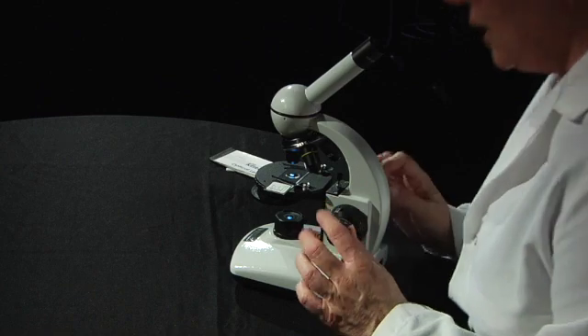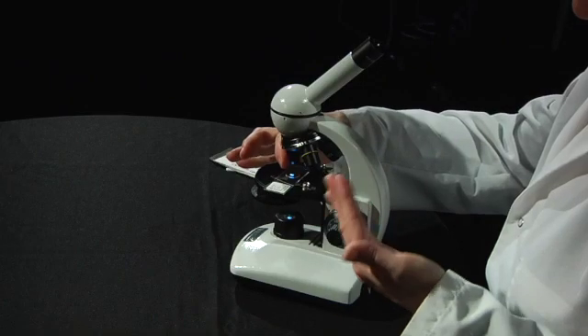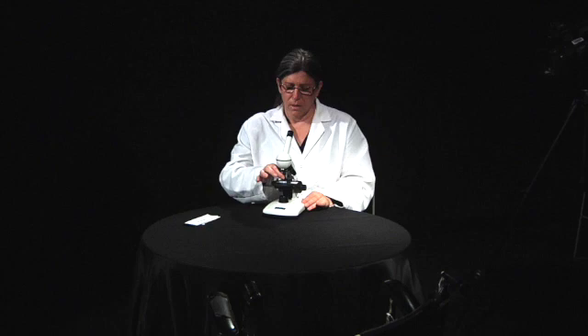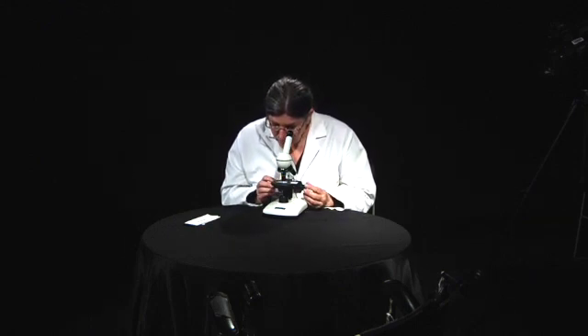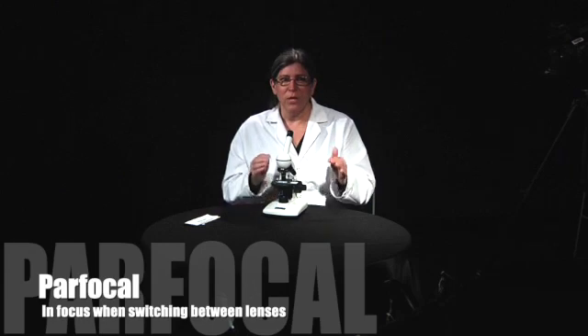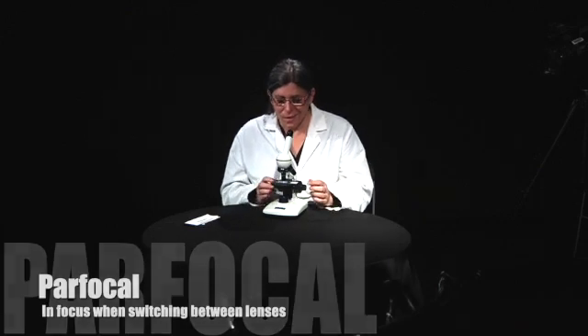Once you get it mostly in focus you can use the fine focus to get it really crisp — the fine focus is a little bit better at getting it to the final crisp stage compared to the coarse focus. When you move up to medium power, turn that revolving nosepiece until the medium power clicks into place and look in again. Your microscope should be par focal, meaning that when you switch between the lenses it should still be mostly in focus, and then you can slightly turn the fine focus to get it a little sharper.